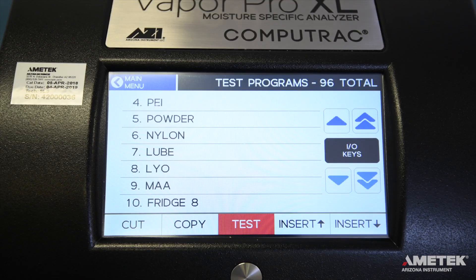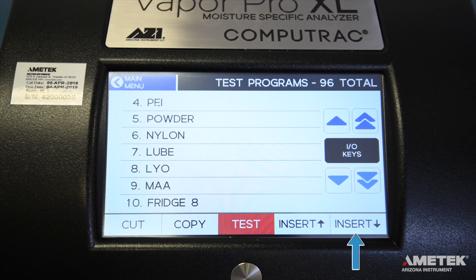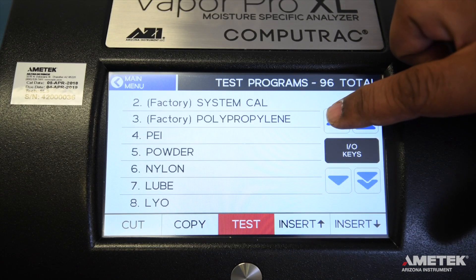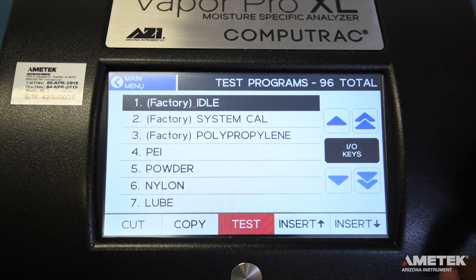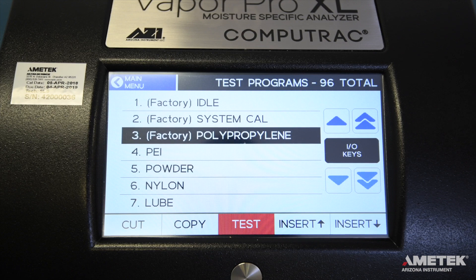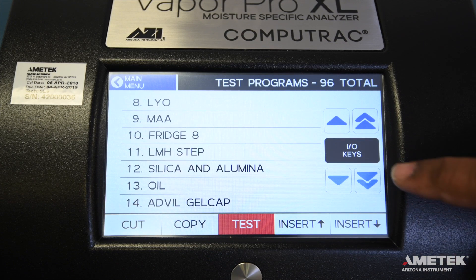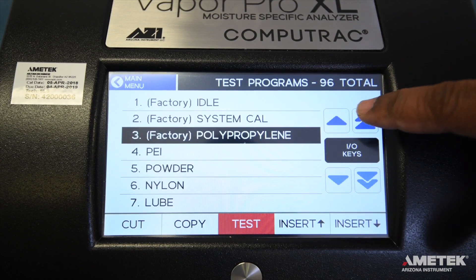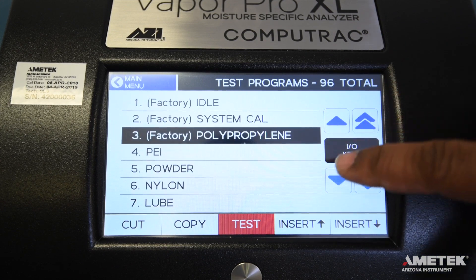To add a program, the buttons you will need to see are Cut, Copy, Insert Above, and Insert Below. Using the arrow buttons, navigate to a spot where you would like to add a program and touch either Insert Above or Insert Below to add a new test program. The double arrows move the cursor up and down by pages, while the single arrows move the cursor up and down by a single line.